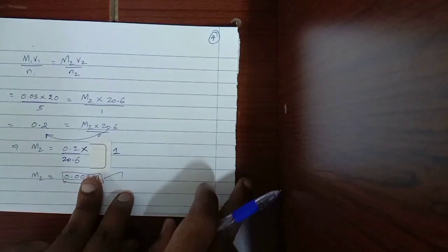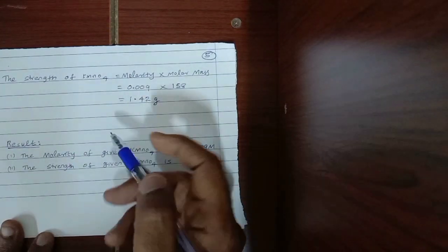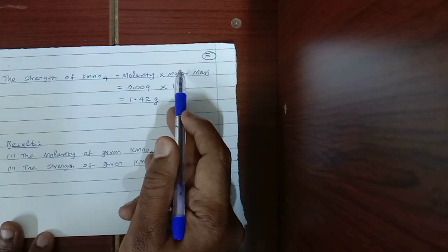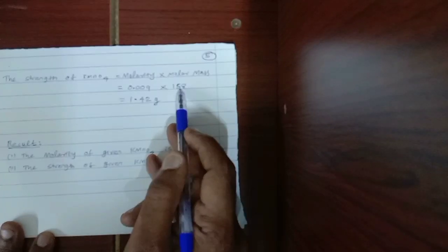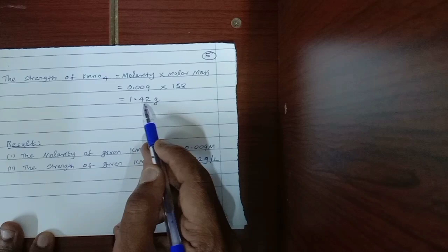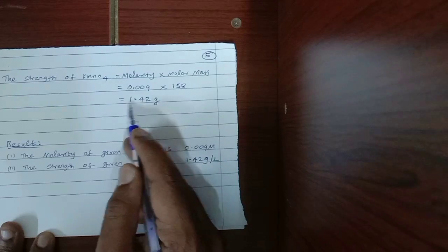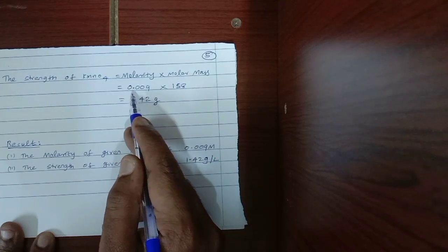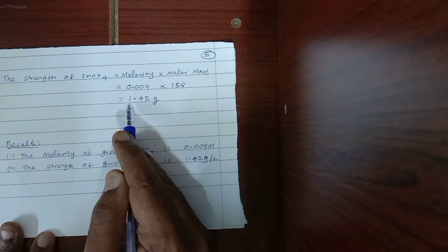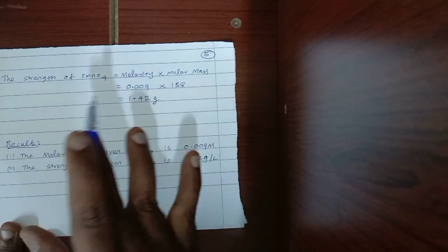Okay. Once you finish the molarity calculation, then you want to proceed to the next one, strength of KMnO4. Strength of KMnO4 is molarity into molar mass. Molar mass we already wrote in the short procedure. You can take it and you can see that 158. Molarity, what you got, you want to substitute here, then multiply with 158. There is no condition that you want to get the same value in the exam. Somebody will get 0.01, somebody will get 0.11. Whatever the molarity is coming, you want to multiply with 158, and somebody will get 1.58, 1.40. So whatever you get, you want to write it.